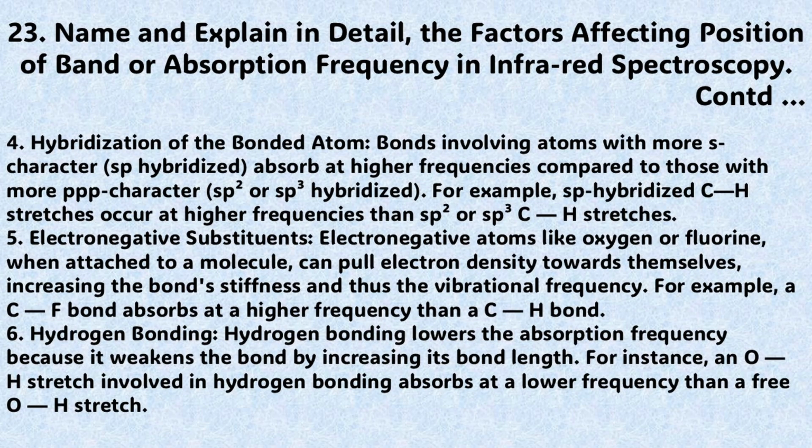Hybridization of the bonded atom: bonds involving atoms with more s character, sp hybridized, absorb at higher frequencies compared to those with more p character, sp2 or sp3 hybridized. For example, sp hybridized C-H stretches occur at higher frequencies than sp2 or sp3 C-H stretches.